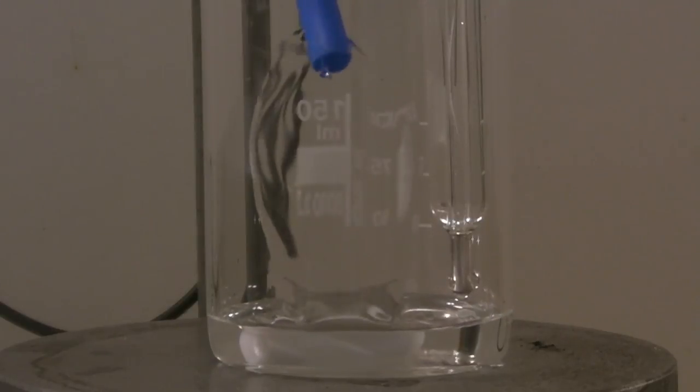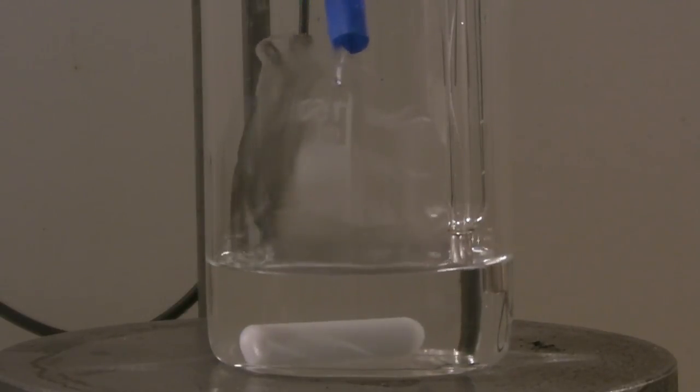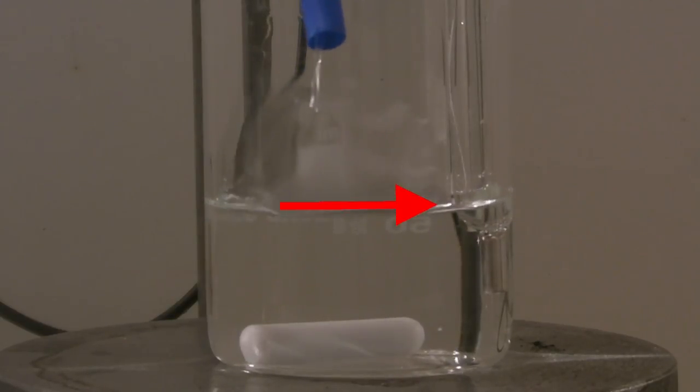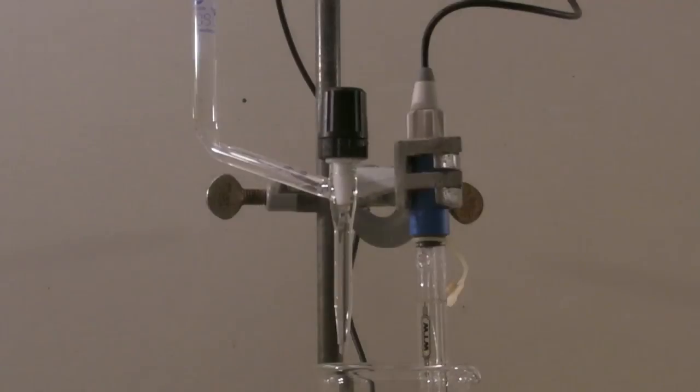The electrode was placed so close to the bottom that the stirring bar was still not able to hit it. Then distilled water was added until the membrane of the electrode was submerged. The refill opening has to be opened in the measurement.